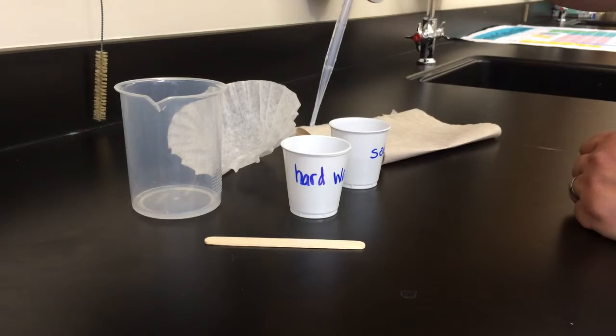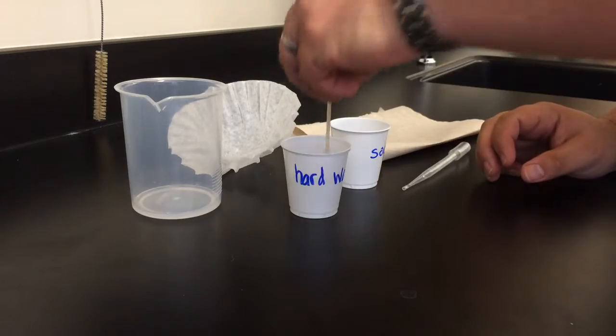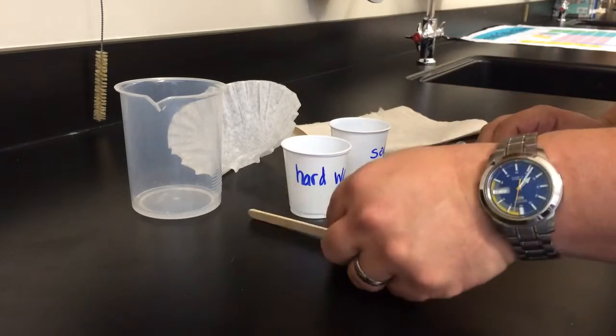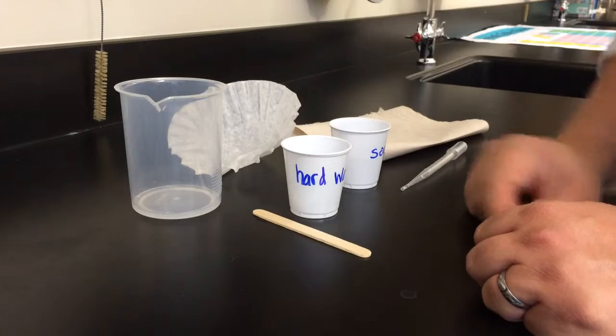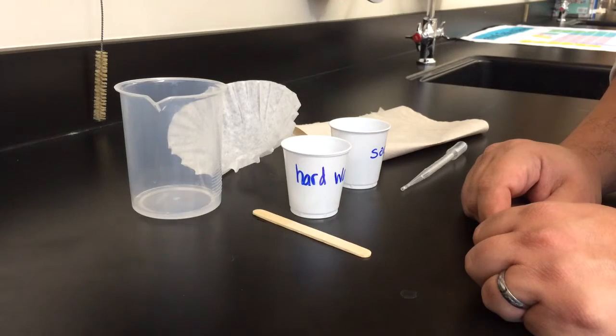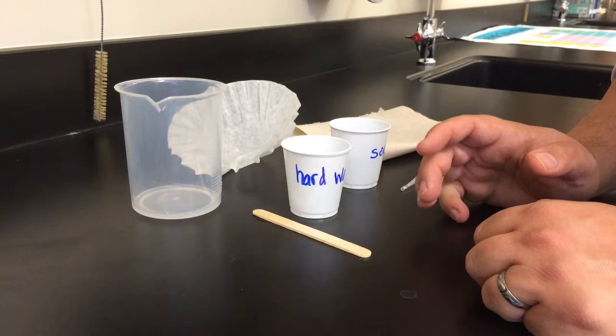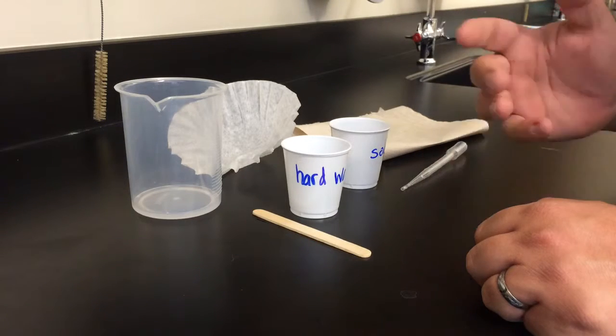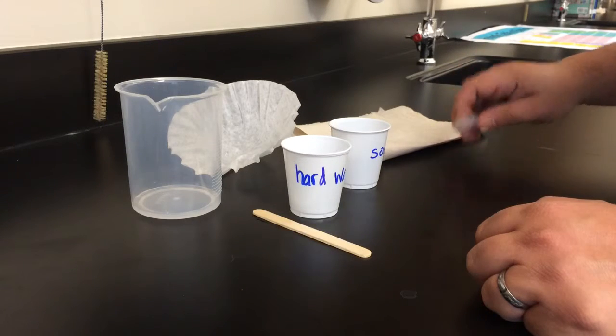Use your popsicle stick to sort of mix things around and you'll notice pretty quickly that there are floating bits of things in the hard water but the question is whether or not they are soap or are they soap scum, the precipitate that we're making.